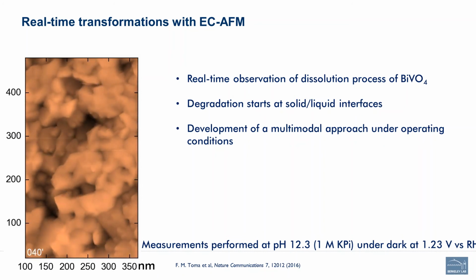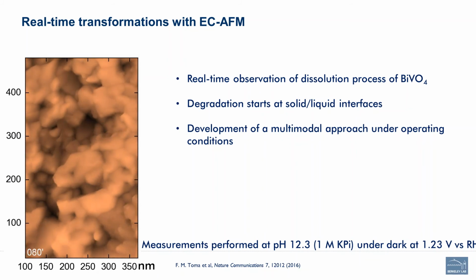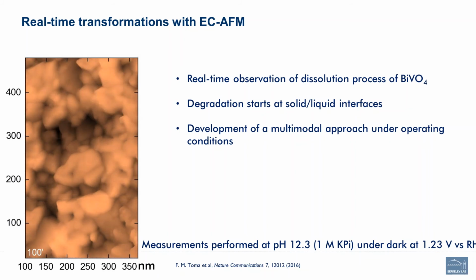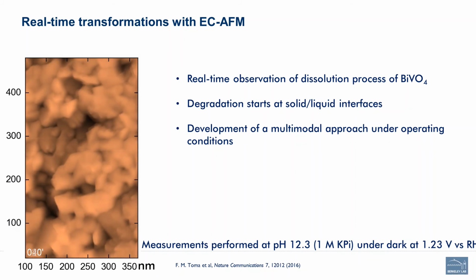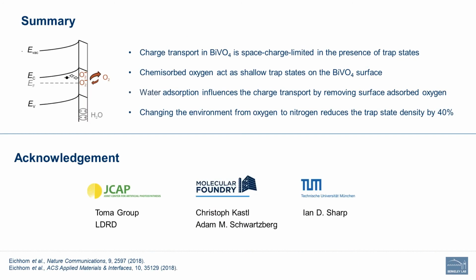Okay, thank you. Yeah, you mentioned environmental control with different levels of water and oxygen. You didn't do that in the glove box though, or how did you control the environment? No, we did not. What we did is we used the fume hood. We flushed basically the whole AFM hood with nitrogen or oxygen, and we set up an environmental control by ourselves.